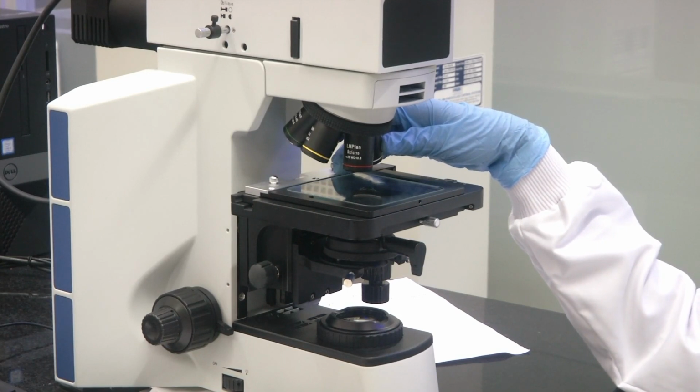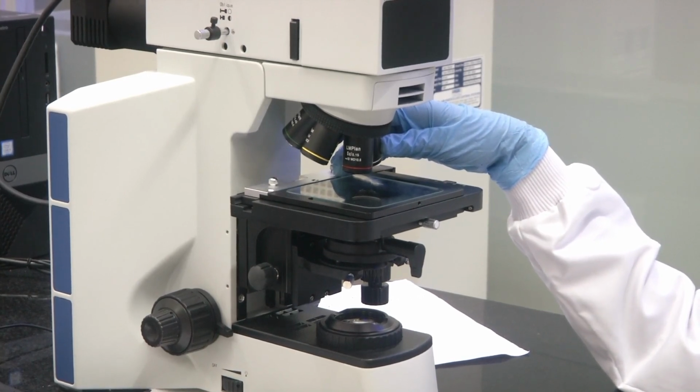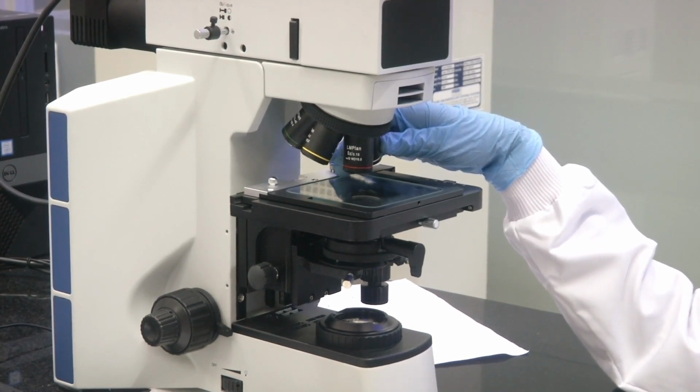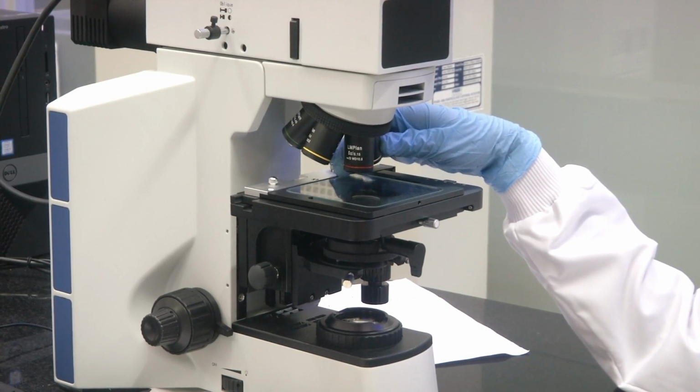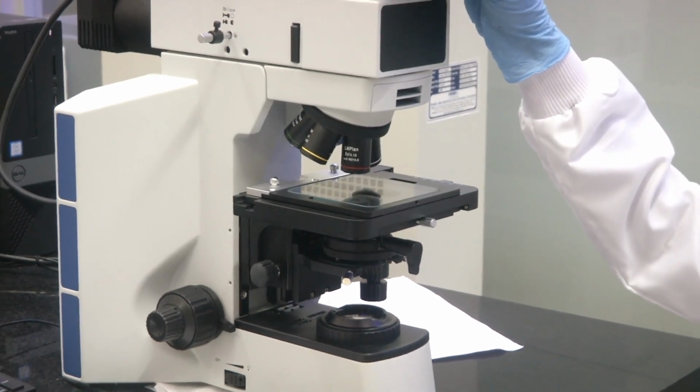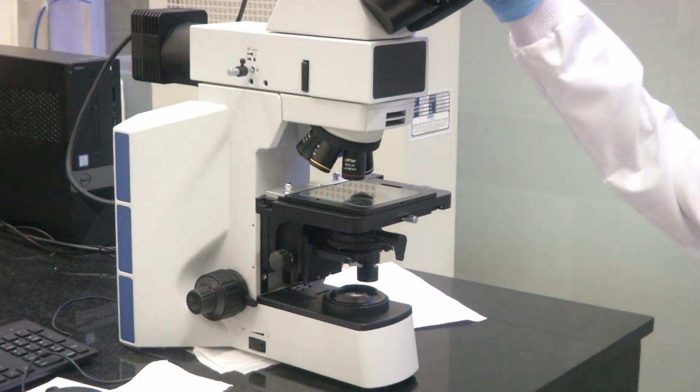The objective is basically your core magnification part in a microscope. The objective consists of a lens of a particular magnification which is connected to your eyepiece. As we had discussed before, the eyepiece, which you can see now here.